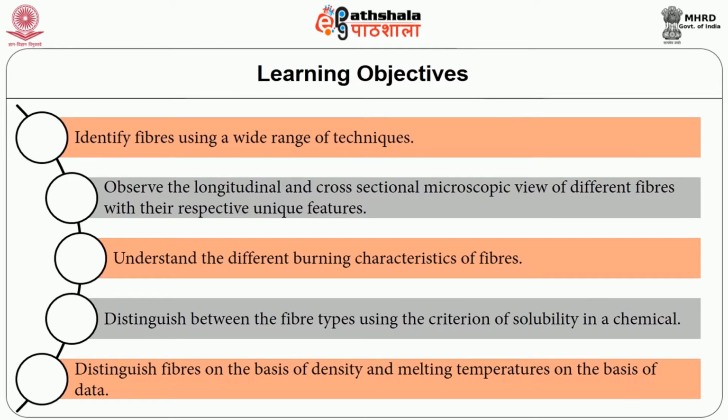Observe the longitudinal and cross-sectional microscopic view of different fibers with their respective unique features. Understand the different burning characteristics of fibers. Distinguish between the fiber types using the criterion of solubility in a chemical. Distinguish fibers on the basis of density and melting temperature.